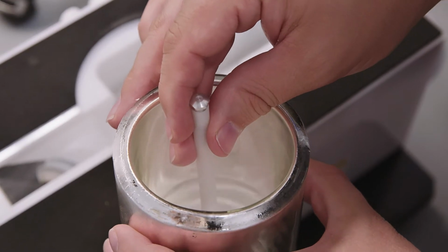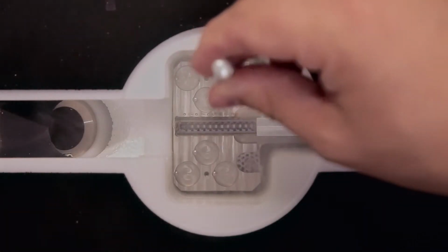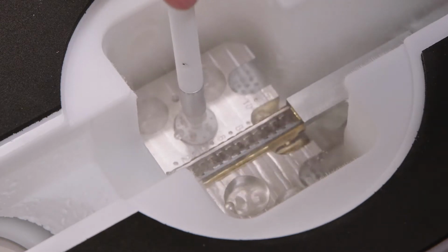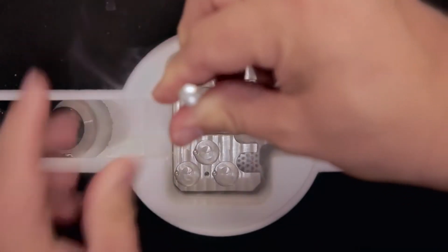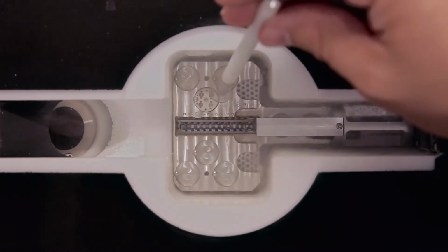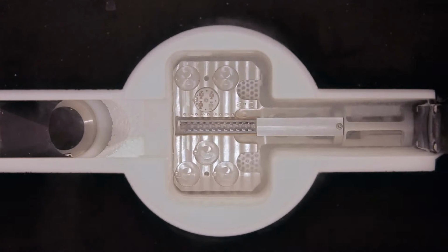You can now take the samples from the storage drawer into the loading station, and you can place the storage box with the autogrid cartridges into one of the slots. I always use the slot closest to the cassette, and then we unscrew the lid from the storage box. Be aware the lid might get stuck.